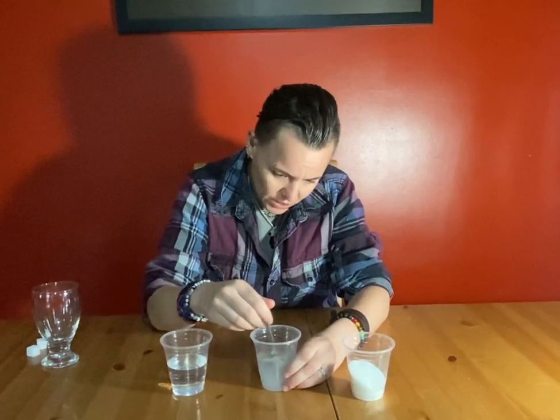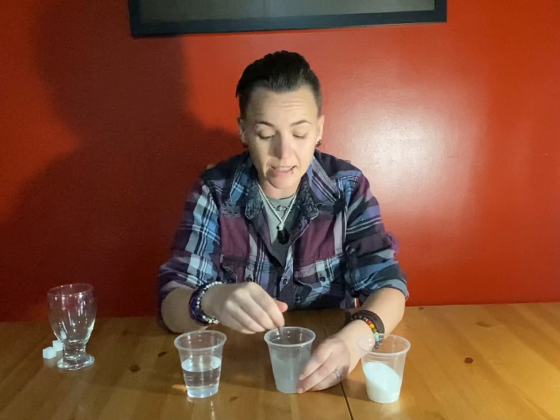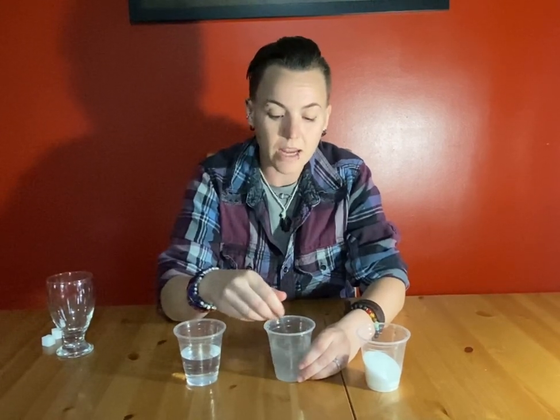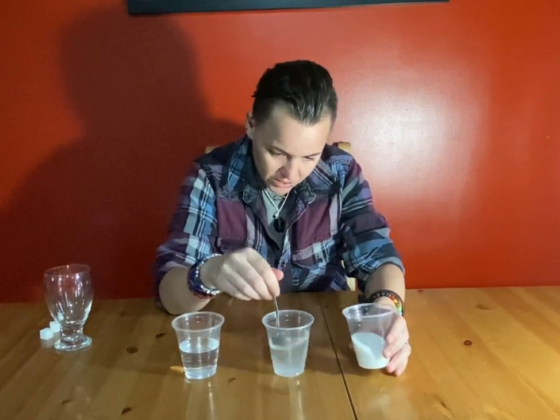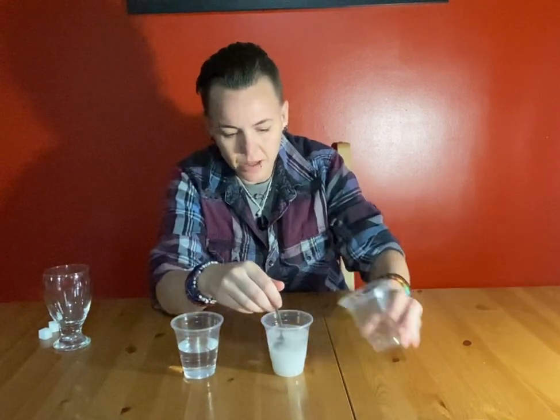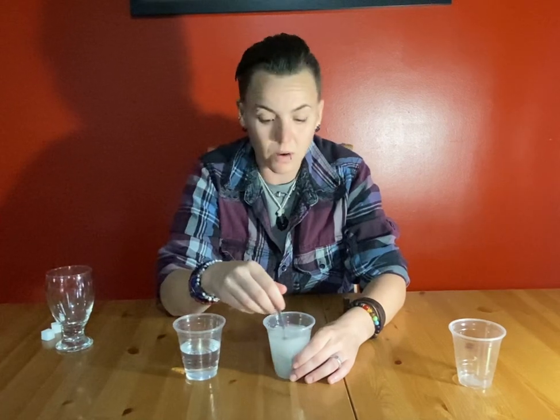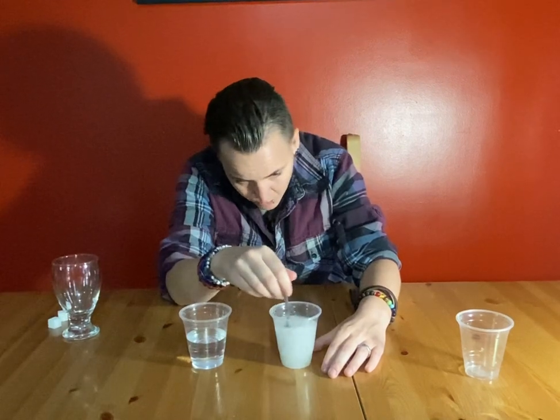So if you stir it and stir it and stir it, eventually all of the crystals, which are a solid, tiny little particles of sugar, that solid is going to dissolve in the water to create liquid sugar. If we add enough sugar to this, we will create liquid sugar. And if you keep stirring it, you'll notice that all of the little particles of sugar dissolve. So we're just gonna add that sugar right in, and we're gonna stir and stir. I gave you the perfect amount to create liquid sugar, essentially. So enough sugar to cause it to be a liquid sugar.